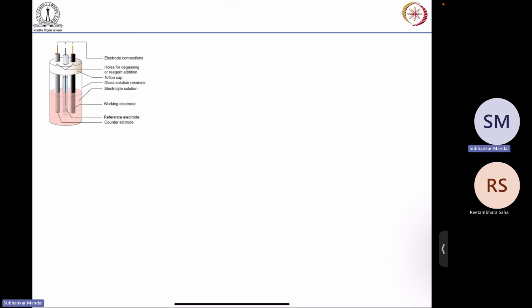Okay. So now this is the electrochemical cell. So nowadays in all research groups, people used to do a 3 electrode setup, where people used to use this kind of thing. So in polarography also we have a container and we have a working electrode, reference electrode, and what is called the counter electrode. So this is the electrochemical cell when you will do the CV, all these things. So a similar kind of electrochemical cell is there. Here you can see 3 electrodes.